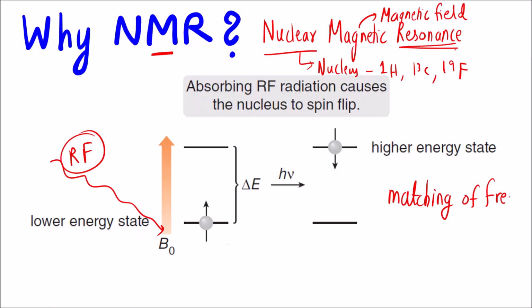Now, which frequency are we talking about here? When the frequency of the radio waves exactly matches the precessional frequency, the precessional frequency meaning the frequency of the nucleus.